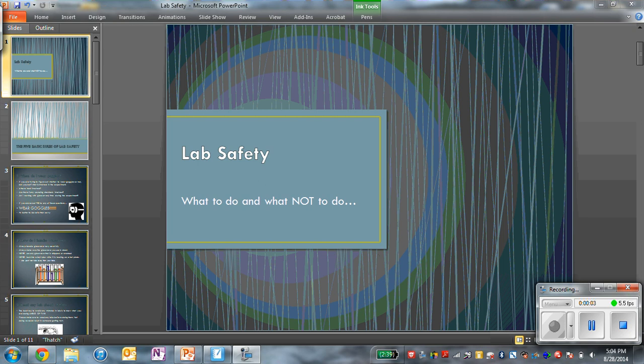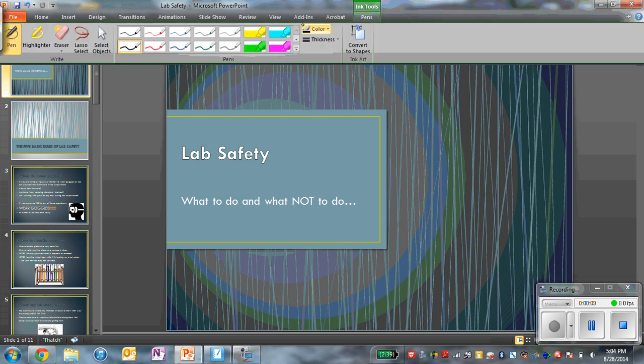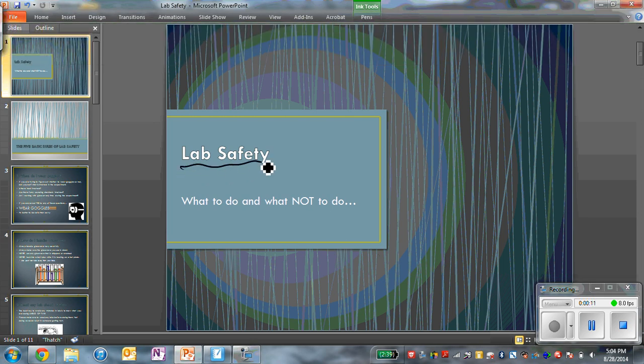Okay, welcome to Unit 1, Lecture number 2. This lecture is going to be about lab safety. So we're going to go through the 5 basic rules of lab safety, basically what to do and not to do in the lab, and then we're going to use those 5 rules we just learned about and see if we can make any observations and inferences about lab safety.